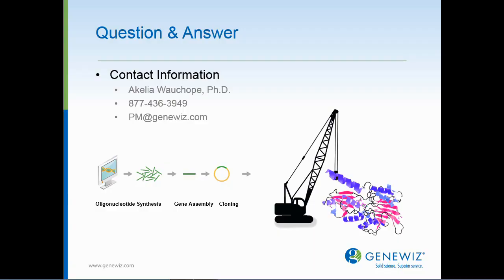So our next question comes from right here in New Jersey, and the question is, what is your opinion on codon de-optimization? Excellent question. Recently, we have received a number of requests from a few clients to perform codon de-optimization, since it's a new way in which one can reduce protein expression levels as opposed to a typical knockout study.